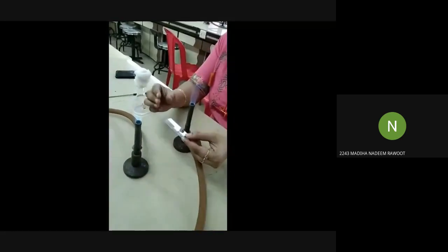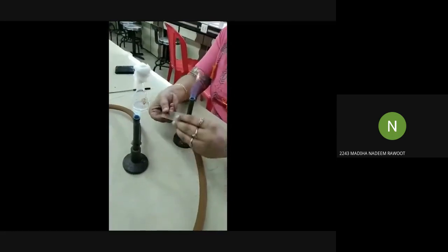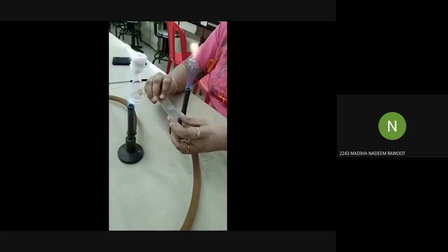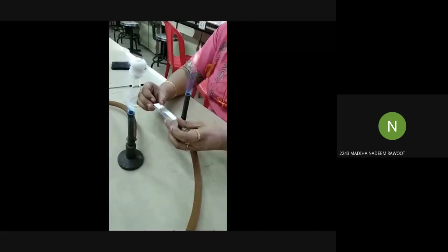The slide has already been air dried, and we will be doing the heat fixing of this slide. Why do we do the heat fixing? So that when we are pouring the dye and washing, the organism should not be washed away. It should be fixed properly on the glass slide. Just 1 or 2 times we allow the slide to move over the flame. Our heat fixing is done, and now we will proceed to staining.